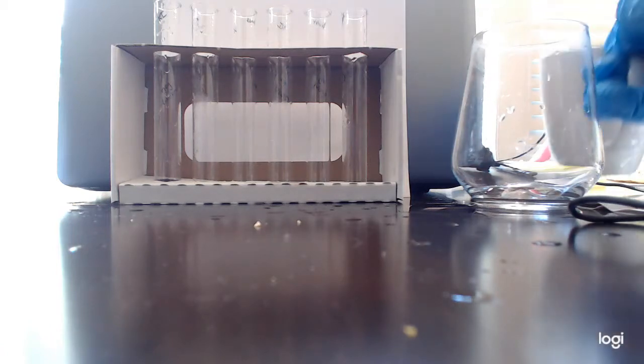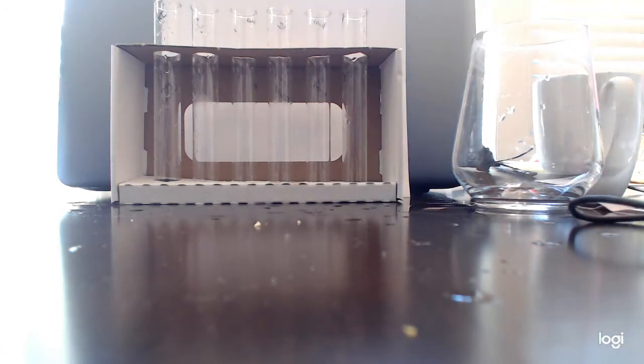All right. We will, however, do the orange juice test. So let's go ahead. You know the drill. We're going to put in our solvent first. So we're going to be putting in water, because as you remember, it is the molecule that supports life. 3 of our 4 biological molecules can dissolve in it. Proteins, carbs, nucleic acids are all soluble in water.